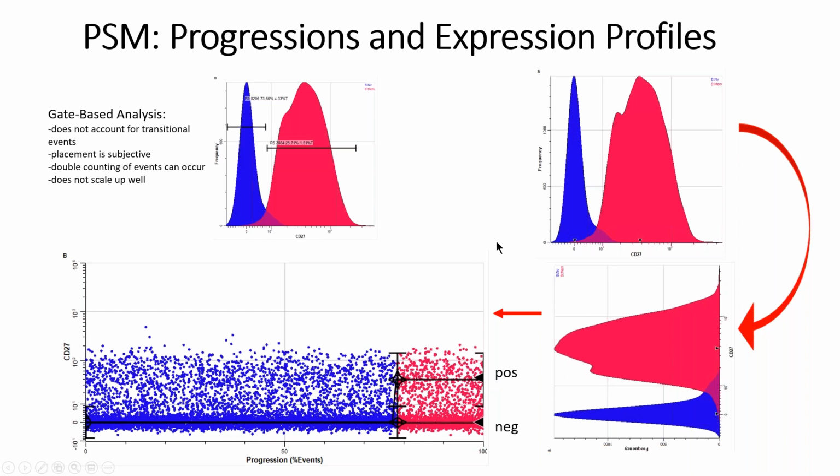So this particular sample is a B cell example, and we know that CD27 upregulates when B cells progress into memory B cells. We can see again that it's two black triangles which identify the negative and positive.